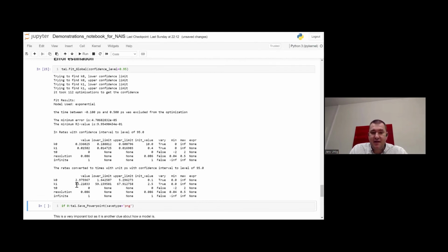And when I did that first statistically safe test, I was very surprised how big that insecurity or how wide those margins actually are. But they tell you a lot about the stability of your model and how close you are to the real data.